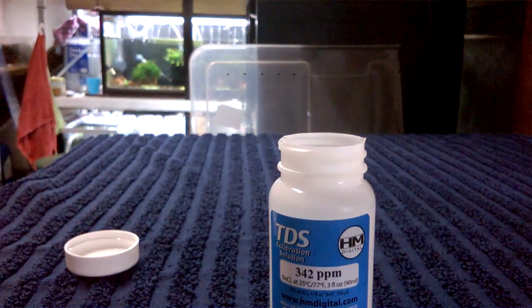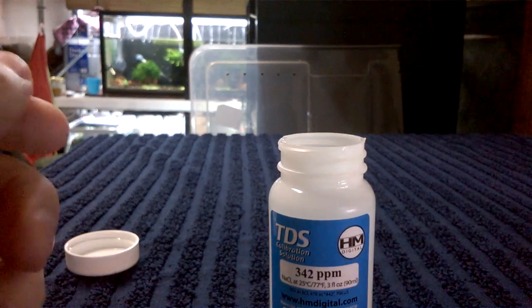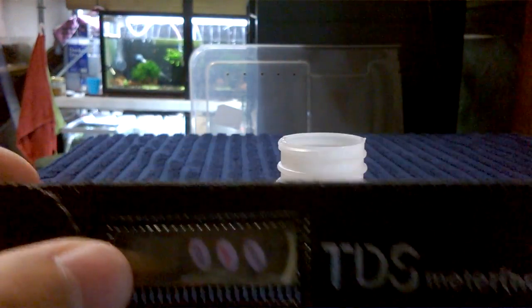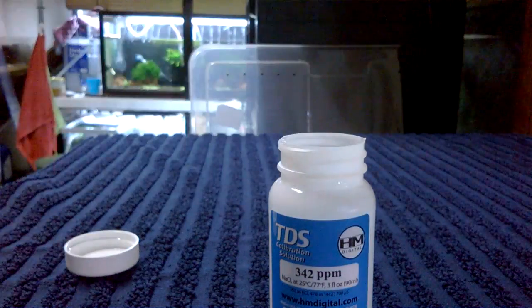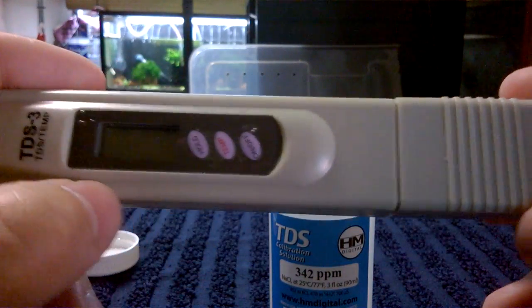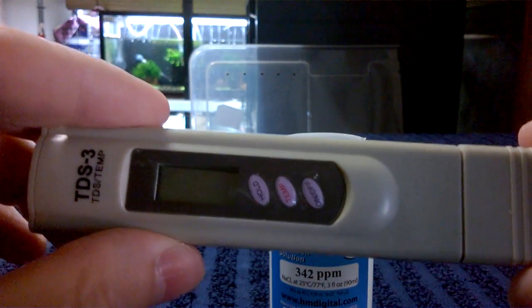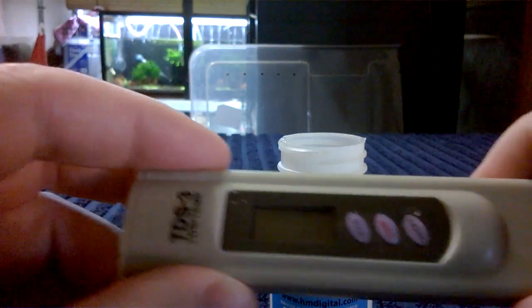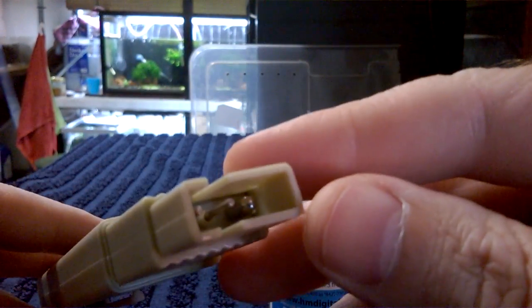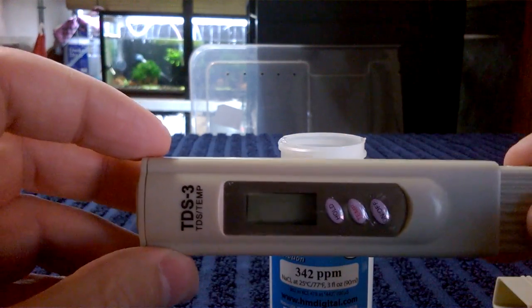Now I want to show you this other one. It looks exactly the same — old one on top, new one underneath, cases are identical. But the thing I noticed as soon as I pulled this new one out of its sheath is it's very light. That set alarm bells ringing for me. I took the end off and noticed the diodes are different inside, though that doesn't necessarily mean something is wrong with it.